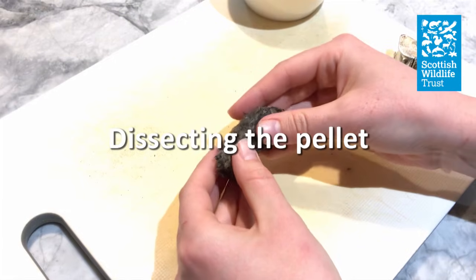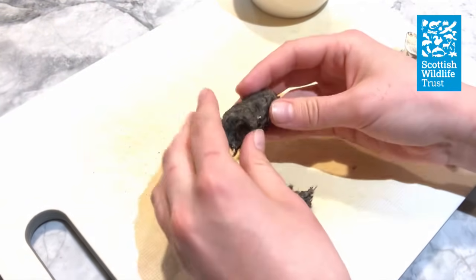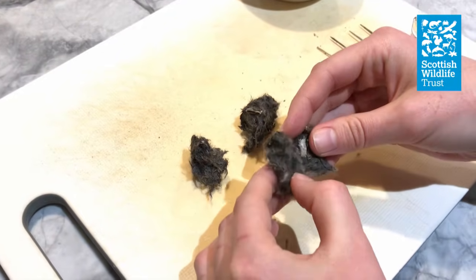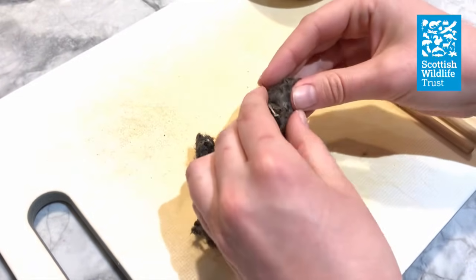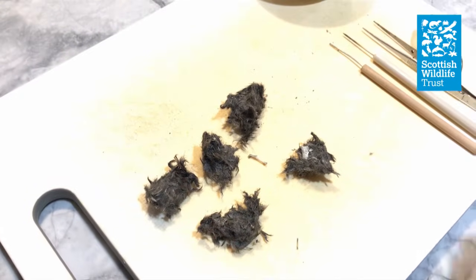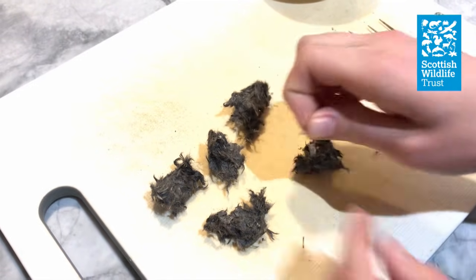I like to start the dissection by just breaking up the owl pellet by hand into several smaller chunks, which are a bit easier to deal with. Be very gentle doing this — the bones are very fragile and you don't want to squash them. If the pellet is very hard, you might want to soak it in water before you start dissecting, which can help to loosen it up a little bit. As you can see, I've already had my first bone fall out of the pellet.